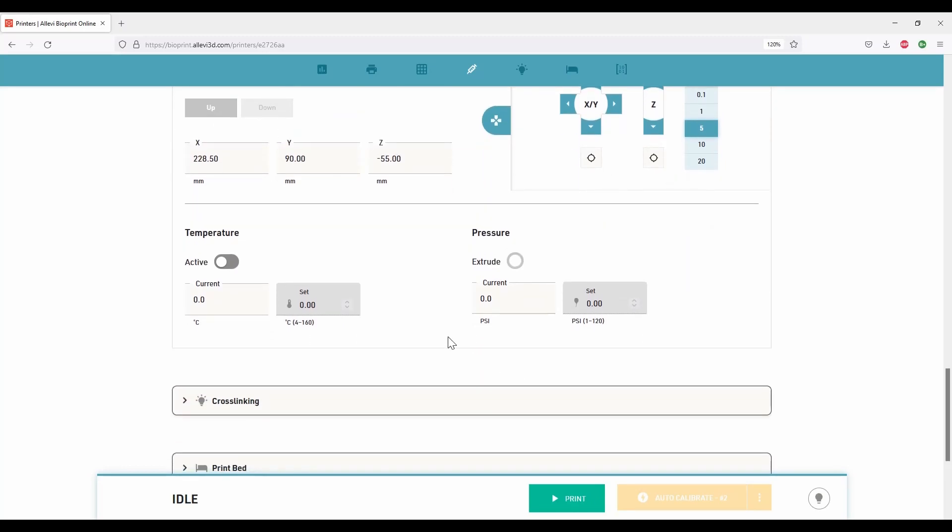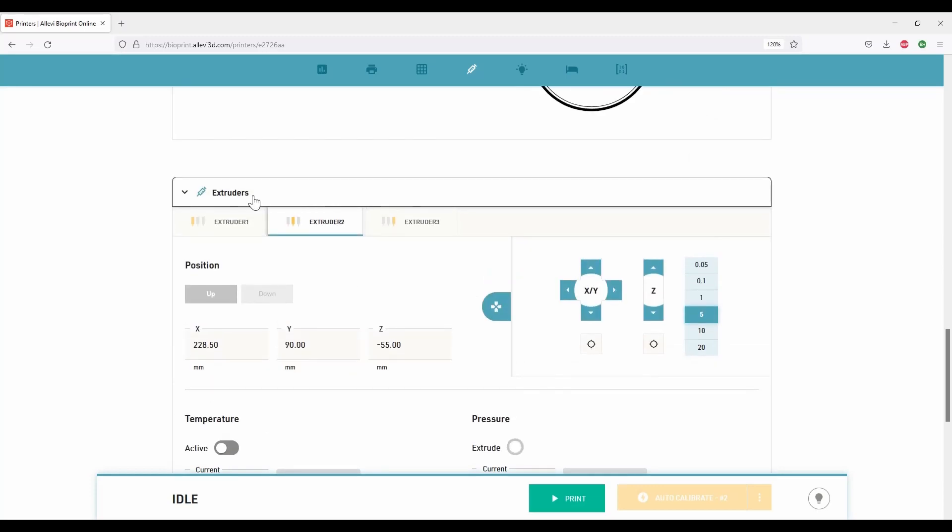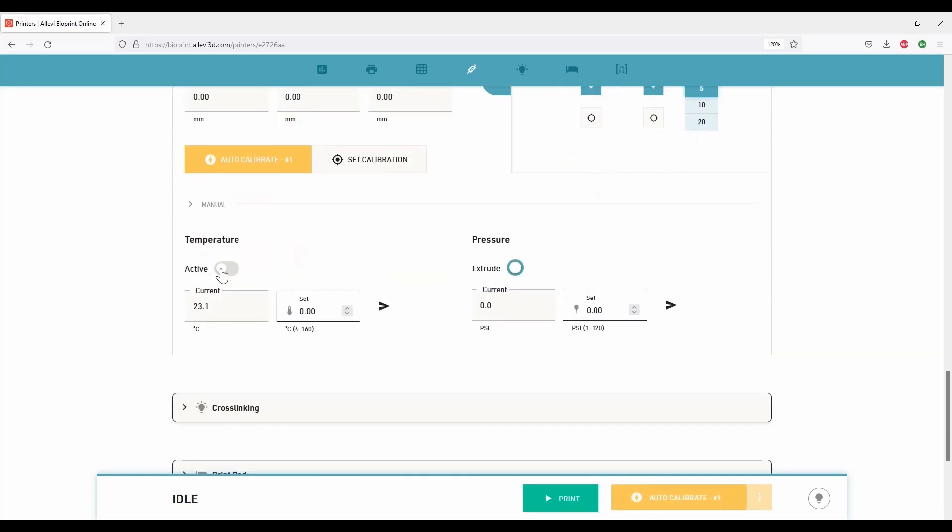If your biomaterial needs to be heated or cooled down, select the extruder. Click on the temperature active. Set the desired value between 4 degrees Celsius and 160 degrees Celsius.